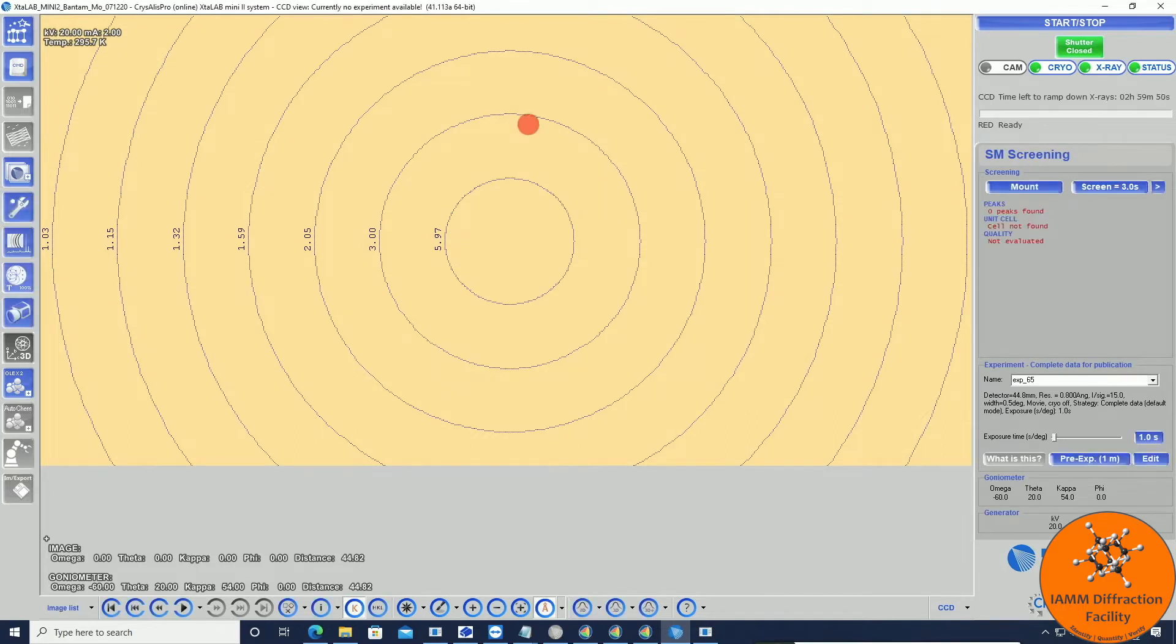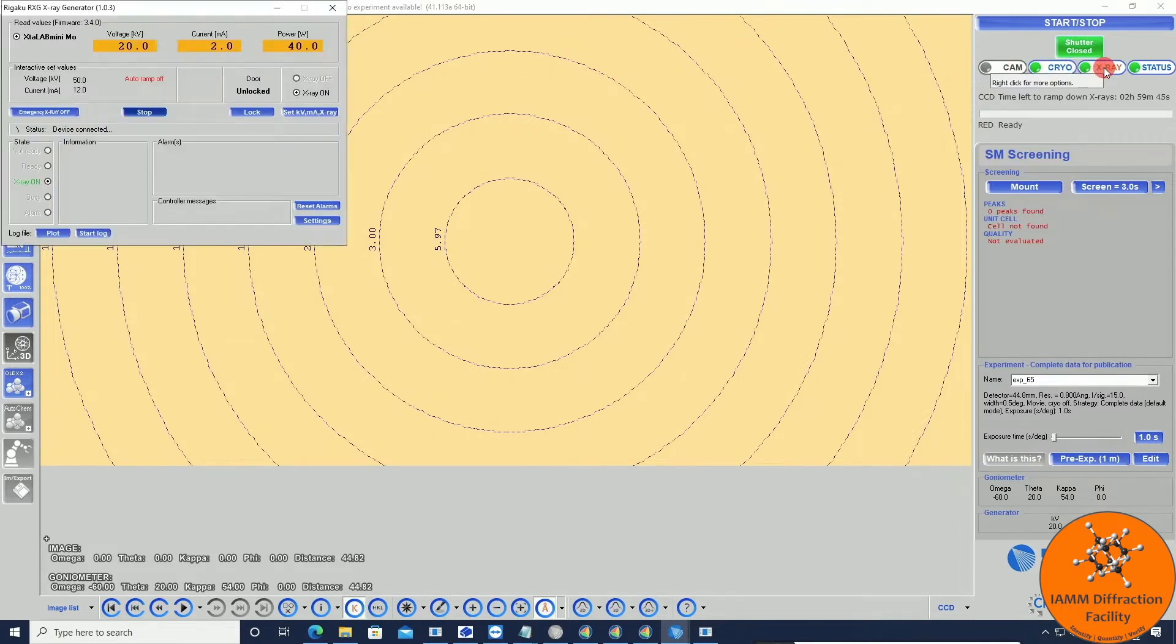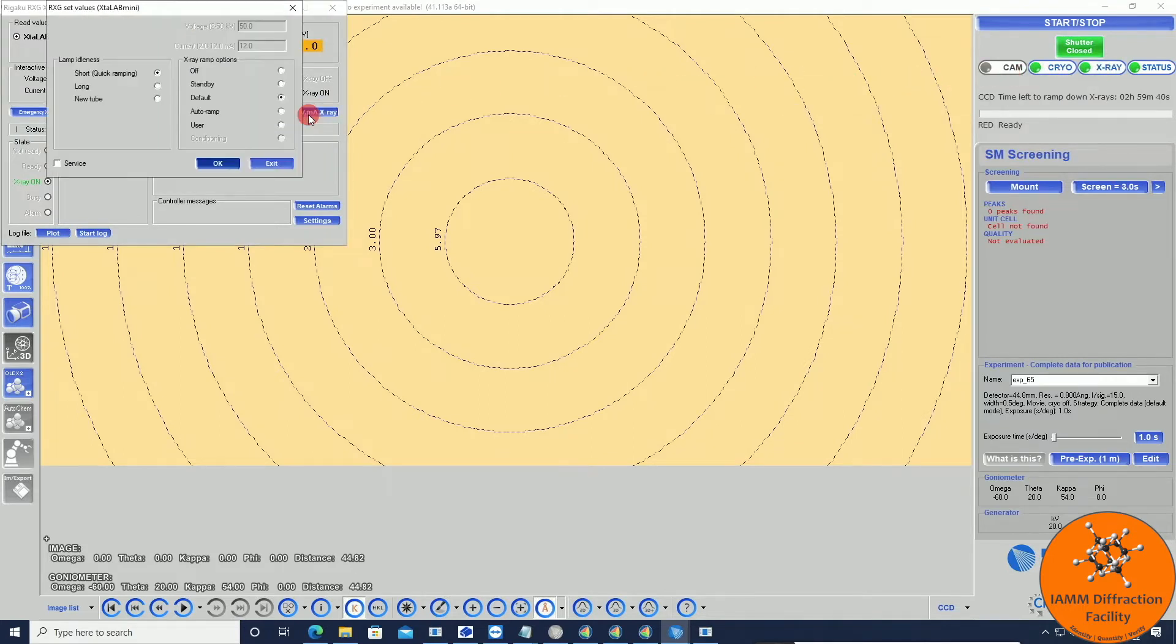If you need to turn up the x-rays, we see that they are currently 20 and 2. Those are the standby settings. We can come over here to x-ray, set kV-mA, choose default, and OK.